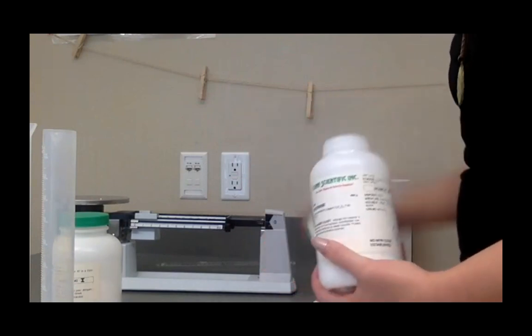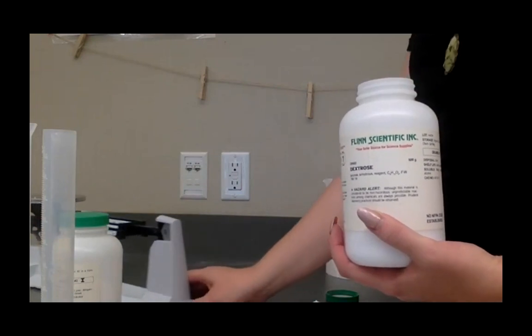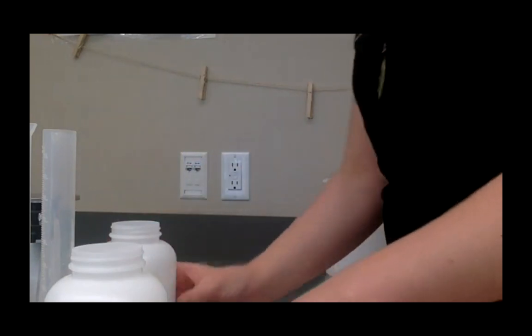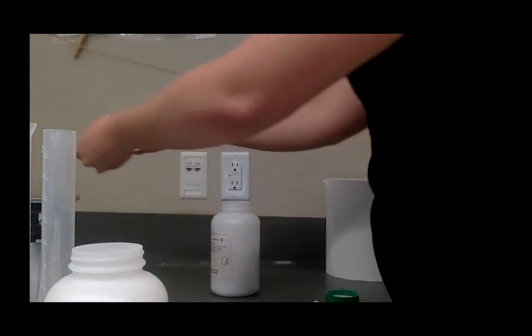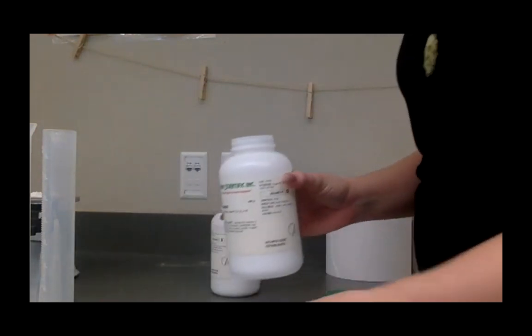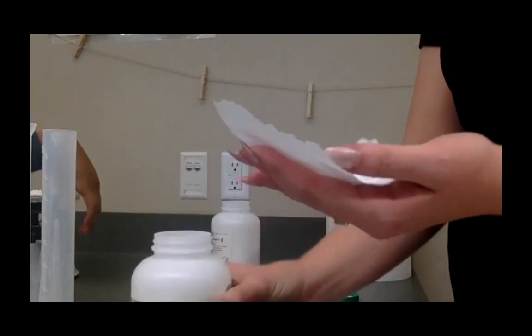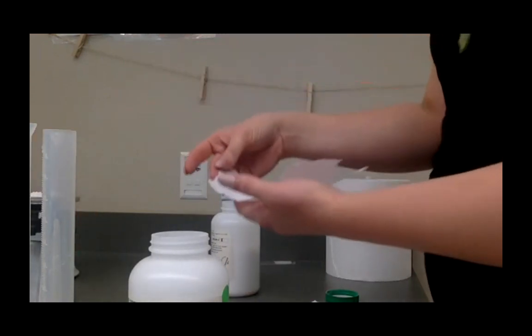All right, so who would like to try the triple beam balance? Do you have a preference for the substance type you would like? No. Okay. Oops, sorry about that. Calcium chloride rolling off the table. Okay, and then we'll also have our glucose sample and our water sample. So this worked out well. There's 3 of you, so you can each do one. You can all do each of them if you want. It's up to you, but we'll have our glucose sample here.